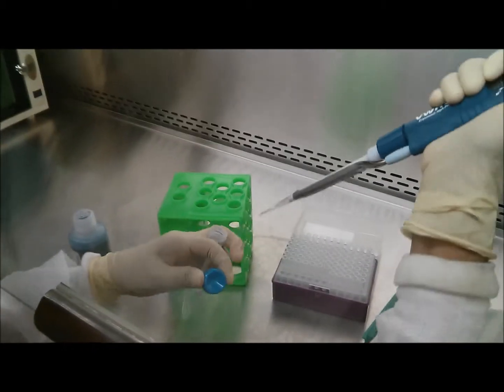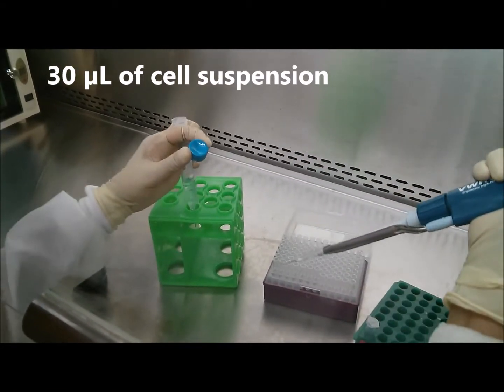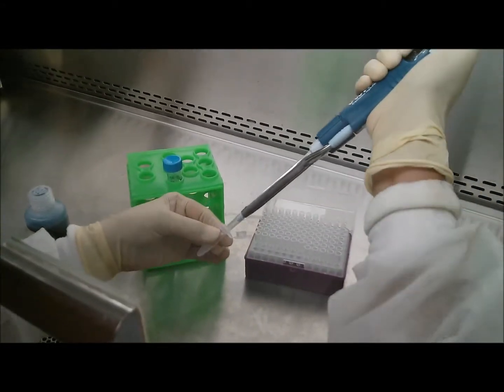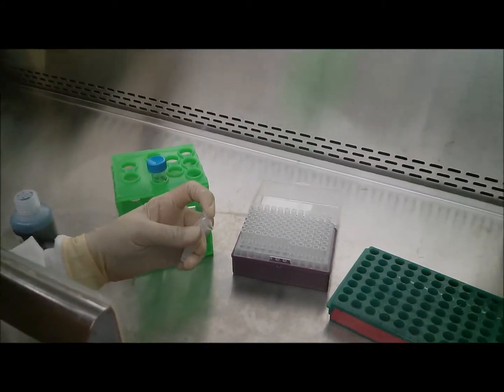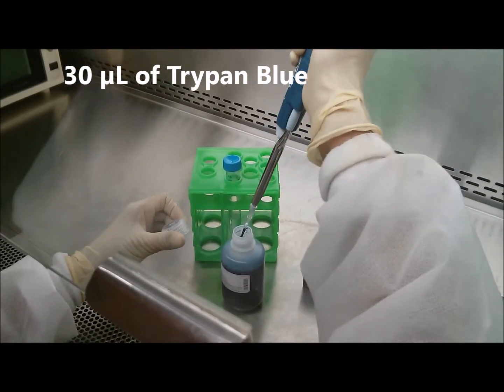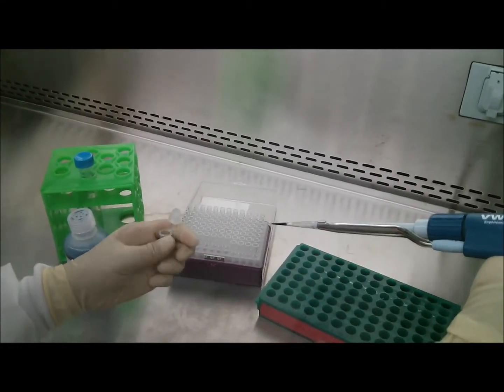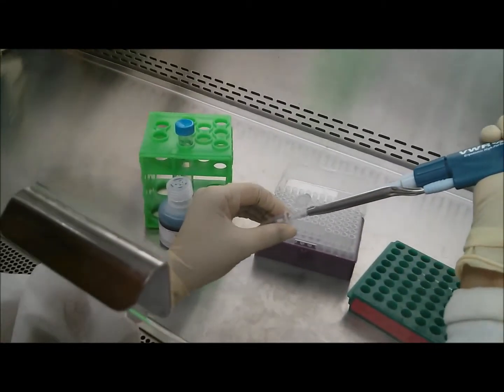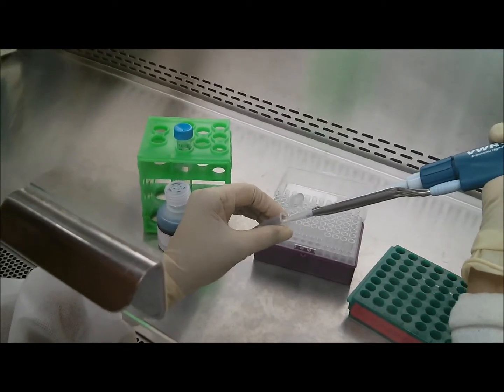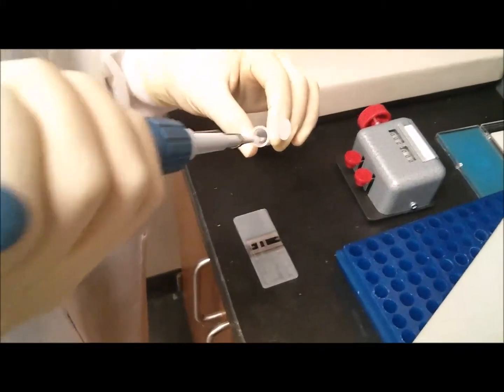In order to prepare samples, first we take 30 microliters of cell suspension, and this is collected in a small 1.5 or 2 ml Eppendorf tube. Then we add 30 microliters of trypan blue to make a 1-to-1 ratio of total solution. Make sure to mix the cell suspension and the trypan blue together well and take this to a hemocytometer.